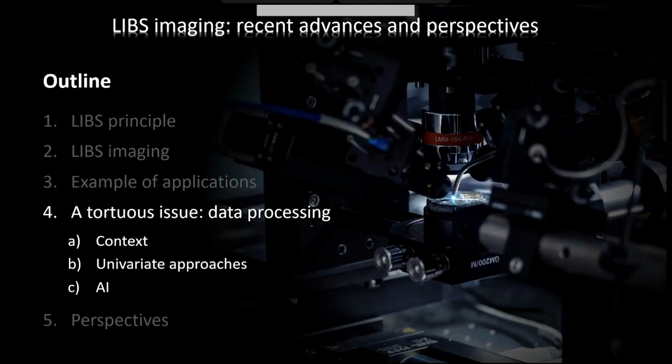I give you this file and say, okay, process the data. What will you do? Honestly, I had some nightmares. Because the first image, you remember this garbage image on the left, very small, few pixels, in fact about 30 by 30 pixels. It took all day at that moment to make the measurements and all night to process the spectra and the image. I did it one time, but not every time because I would die.